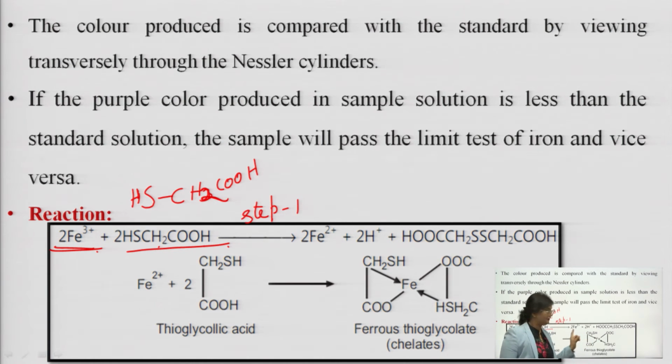Reduction reaction is happening here. This Fe2+ further reacts with another molecule of thioglycolic acid to form a ferrous thioglycolate.